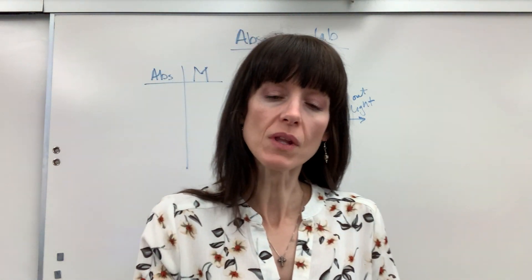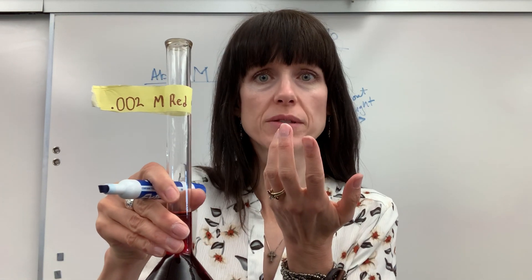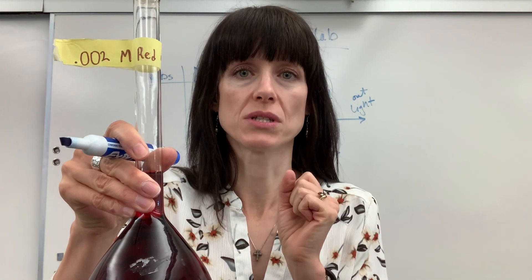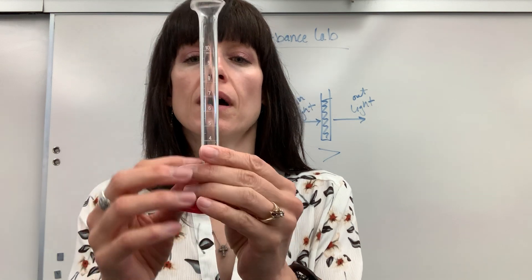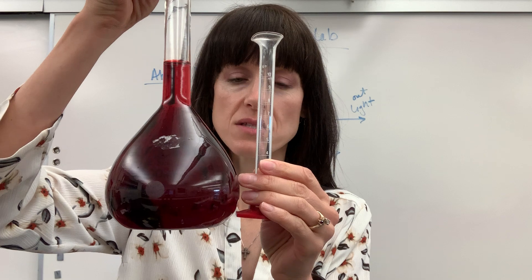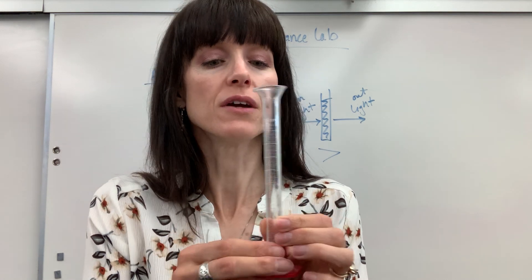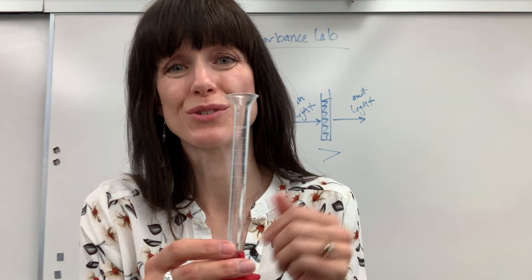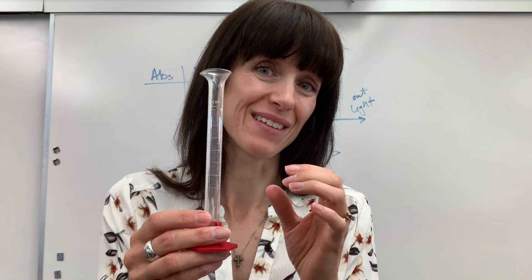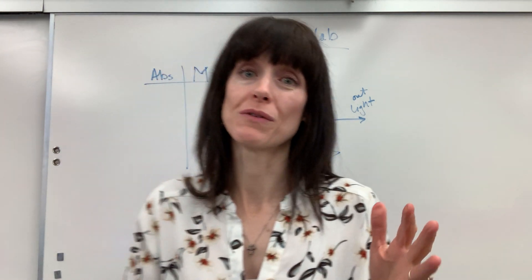Here's how you do it. You take your stock solution — in this case 0.002 molar — and start making some dilutions. With safety glasses on, I would pour five mils of Red 40 into a graduated cylinder, then add distilled water and bring it to a volume of 10 mils. A volumetric flask would be even more accurate, but I have my students use a graduated cylinder since my classroom doesn't have tiny volumetric flasks.